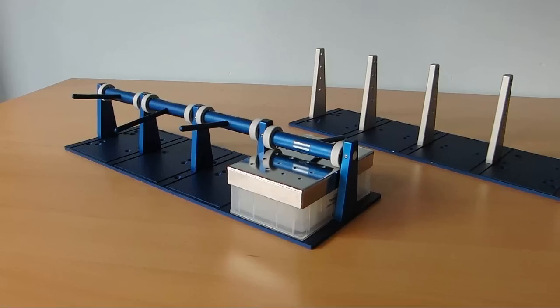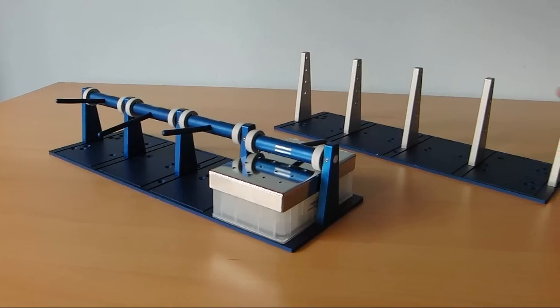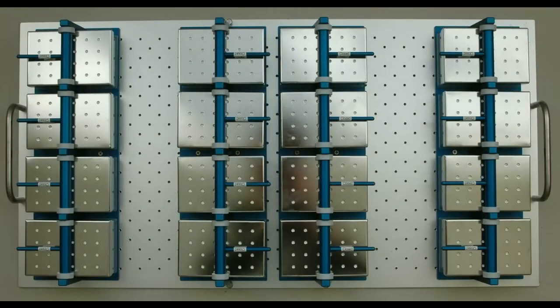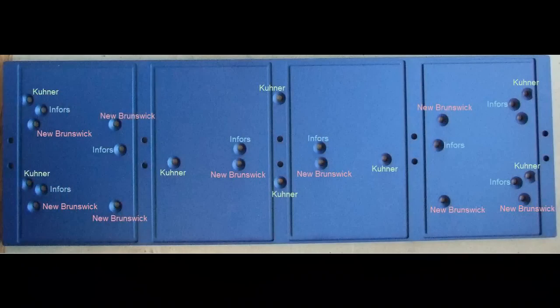For the purpose of this video demonstration, we have shown the use of the two clamp systems on a normal table. In usual laboratory practice, the clamp systems remain attached with screws to an orbital shaker platform inside a temperature incubator.